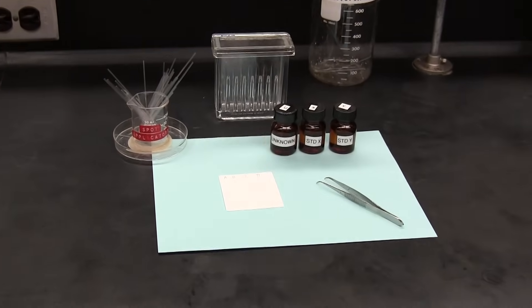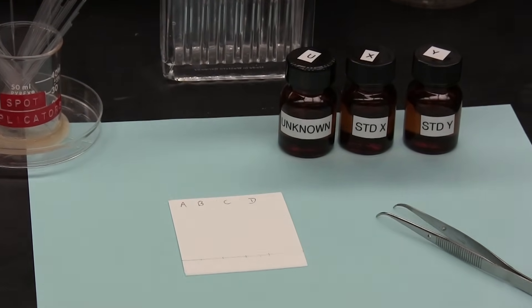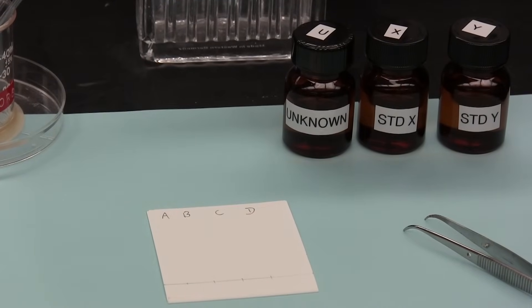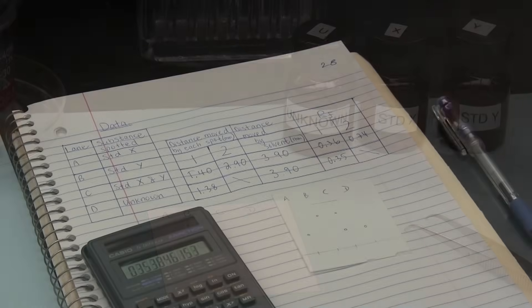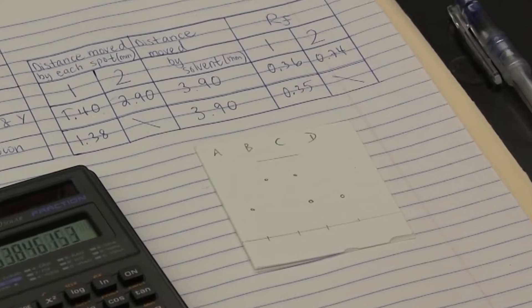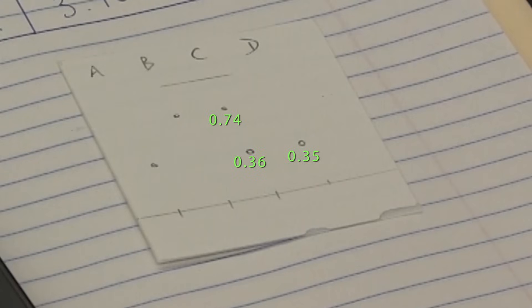Nevertheless, in most cases, it's possible to confirm the presence or absence of a compound by comparing its RF value to that of a reference or standard run alongside it on the same TLC plate. Here we can see that the RF of the spot in lane D is much closer to the RF of compound X than the RF of compound Y, and since we knew that the unknown was one or the other, we can confirm the unknown's identity as being compound X.